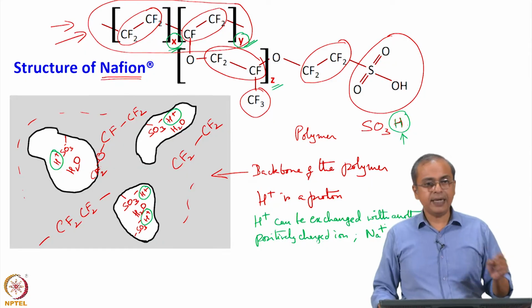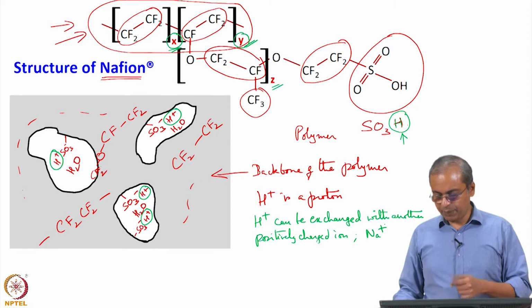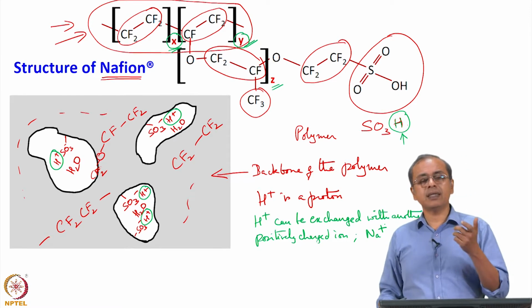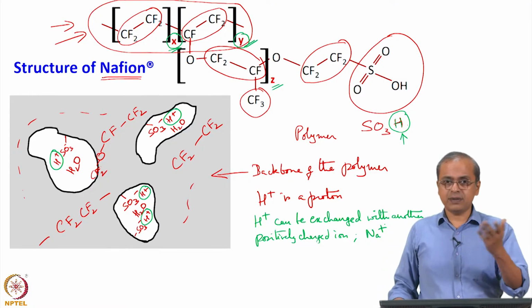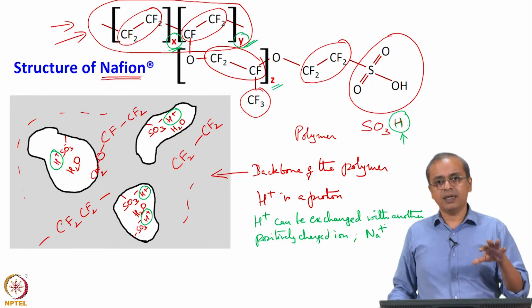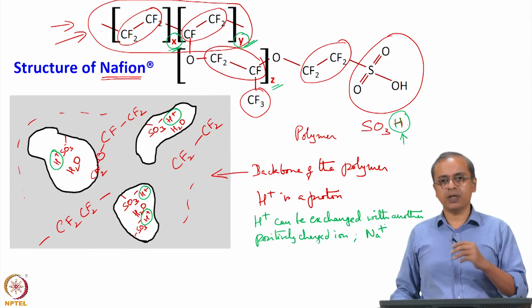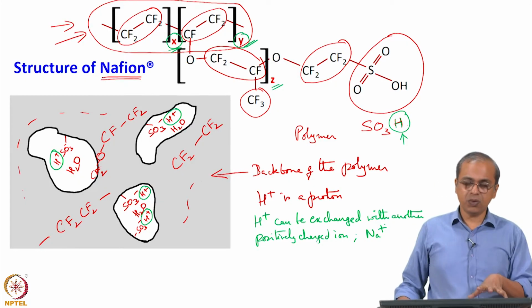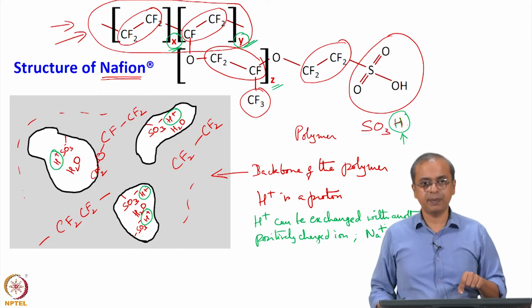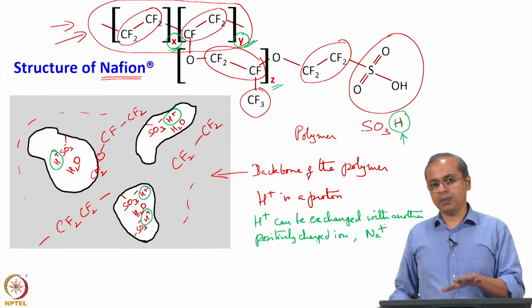So, you can actually take this membrane and fill it with different ions, any positively charged ion. Typically any metallic ion you can fill inside this. So, that is an advantage as well as a disadvantage depending on where you are trying to use it. In our application, where we are trying to create nanomaterials of some particular variety, this turns out to be an advantage because we want a different metal to be present inside this membrane, and that is what we are trying to do.